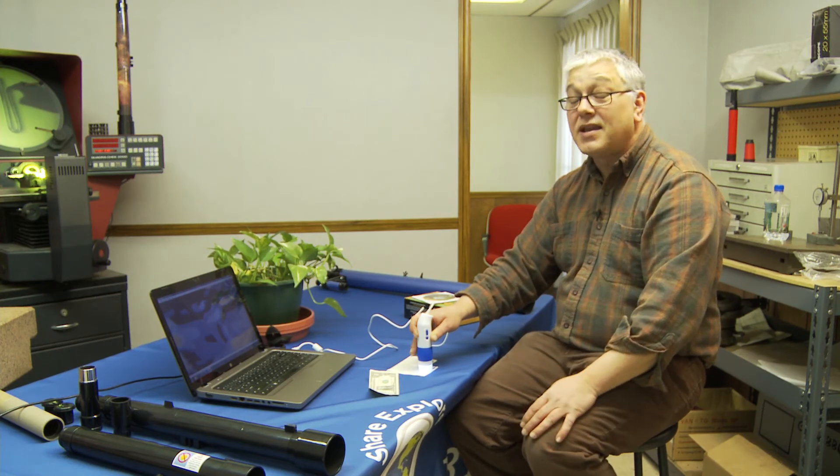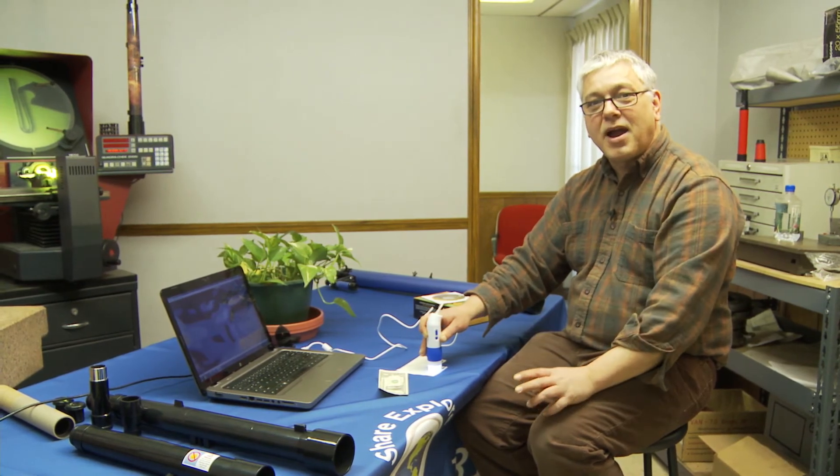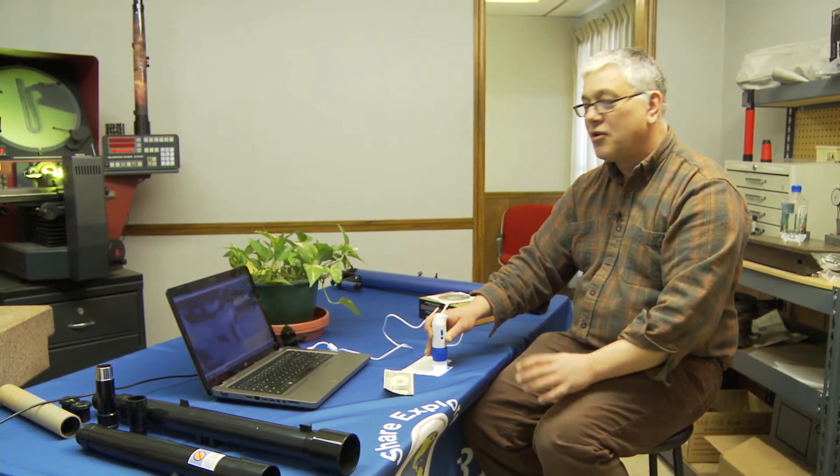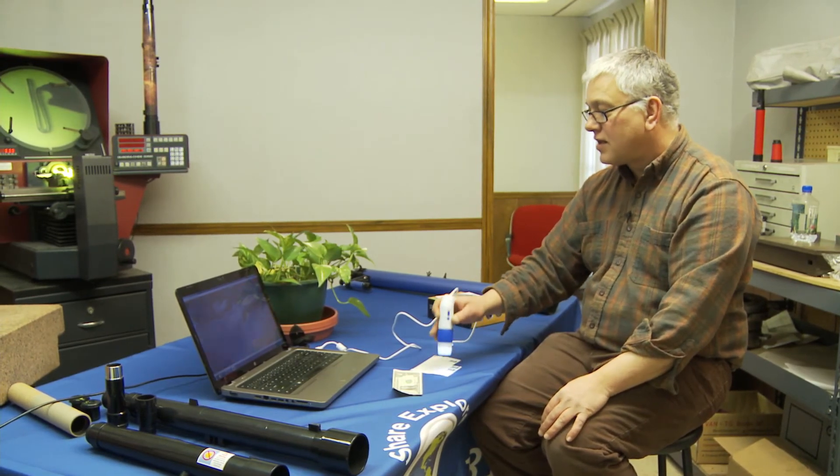Also, we can take videos. So we can take a two or three minute video of an insect crawling by at high or low magnification, or whatever you want to see that's actually moving and you want to inspect later. So that's kind of a cool feature.